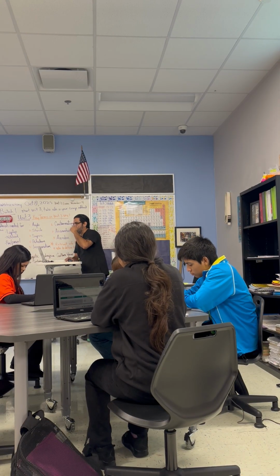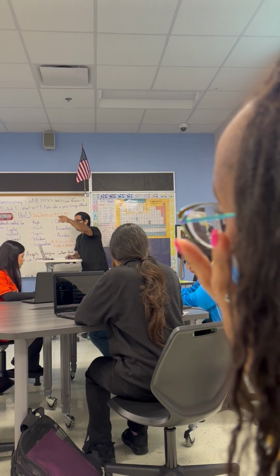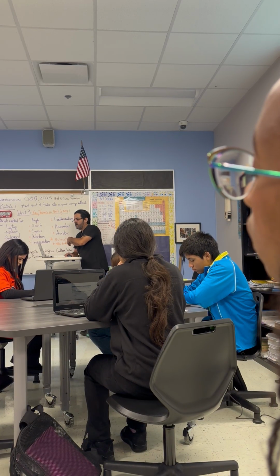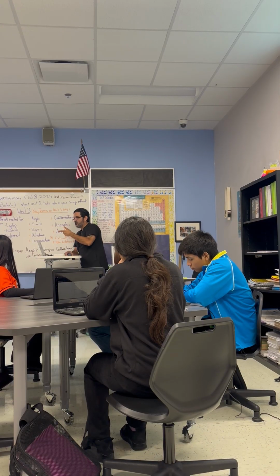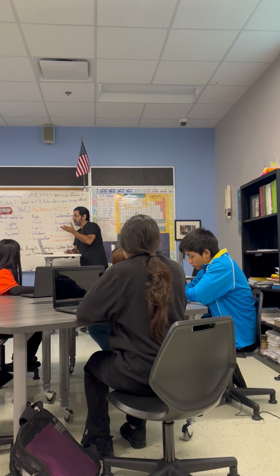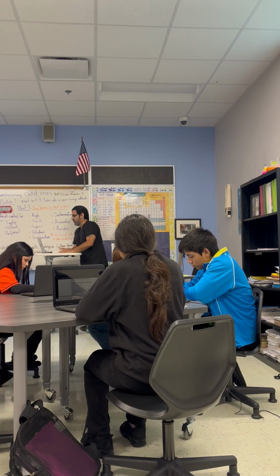You guys are familiar with it from when we've done those culture plates. The first thing we tried to do was have everybody wash their hands, right? And then coming back, you get your gloves and your lab coat and your goggles. Would you consider those to be essential aseptic procedures to make sure that your microbes and even your health is protected?